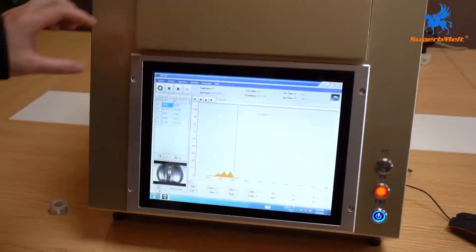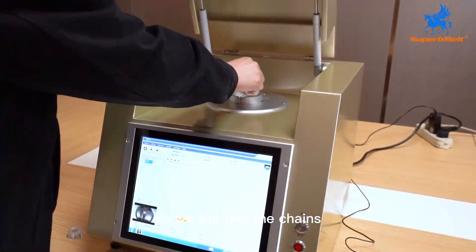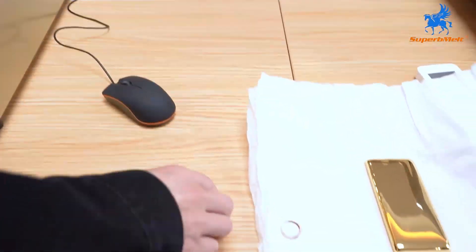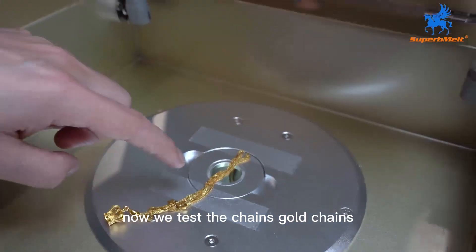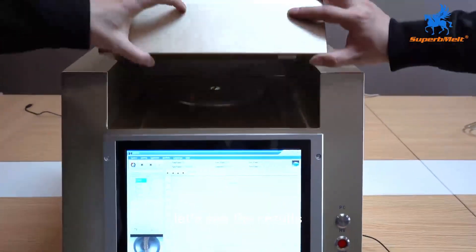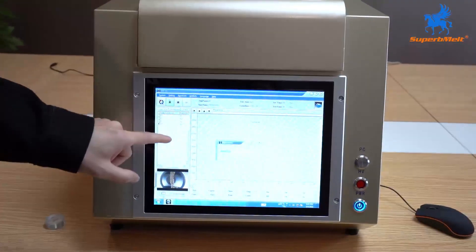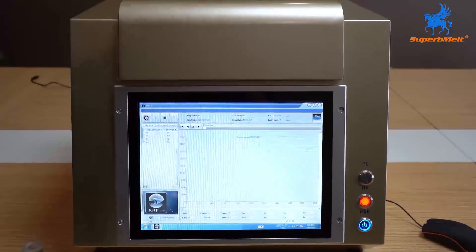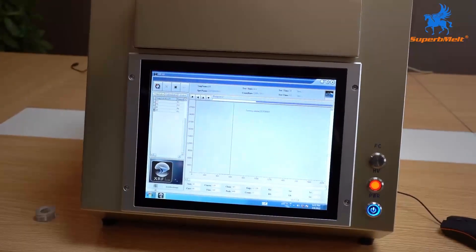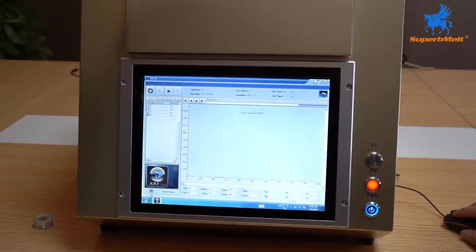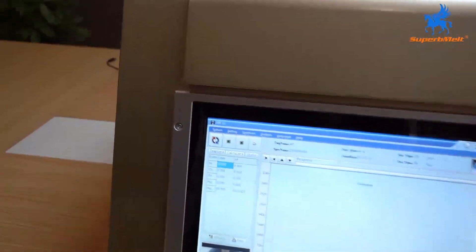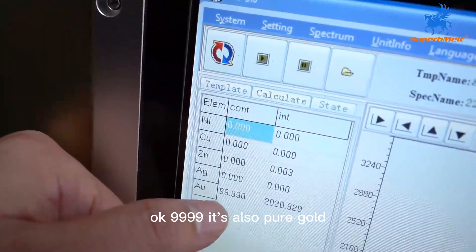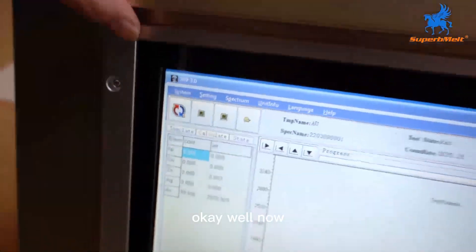We will test the chains. Now we test the chains, gold chains. This is pure one. Let's see the result. Let's test. It's 4-9. This chain is pure gold also, 4-9-30.